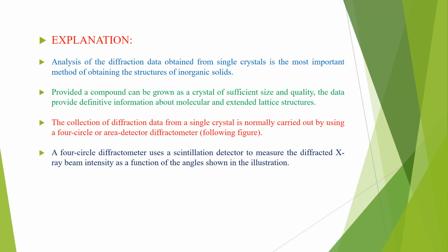In explanation, we see that the analysis of diffraction data obtained from a single crystal is the most important method of obtaining the structure of inorganic solids. As we know, inorganic solids are solids which are found in the crystalline state.